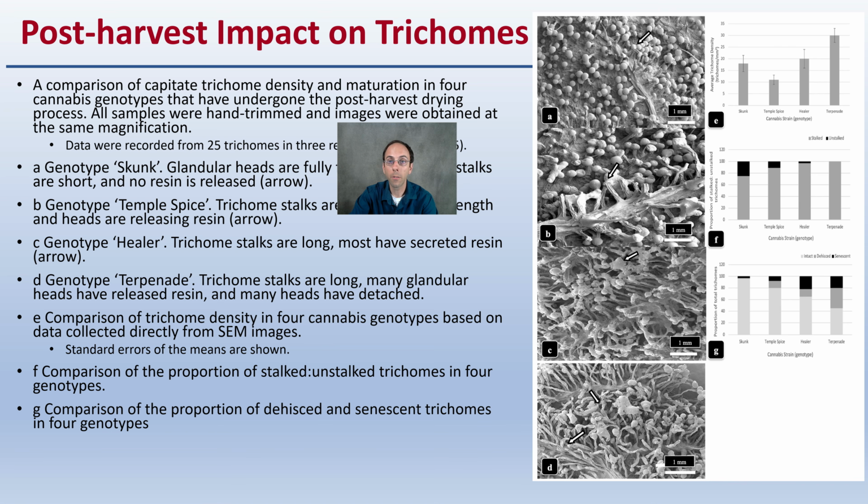So I hope you liked this in-depth microscopic look at things, and that you were able to tune in to the end here. It is a pretty intense look, but definitely take a look at the research article, with some quality images, so you can appreciate those trichomes, hopefully on a whole new level.